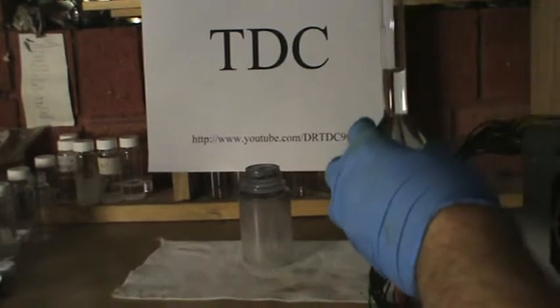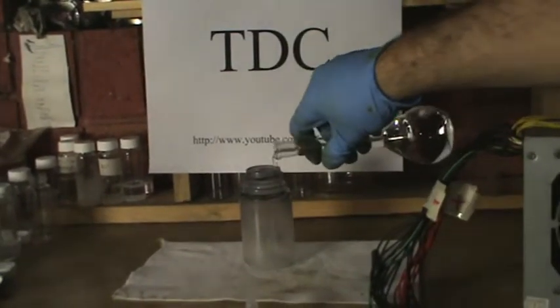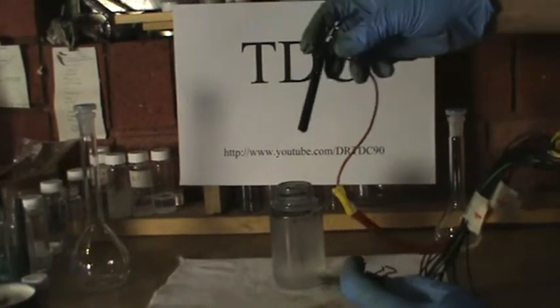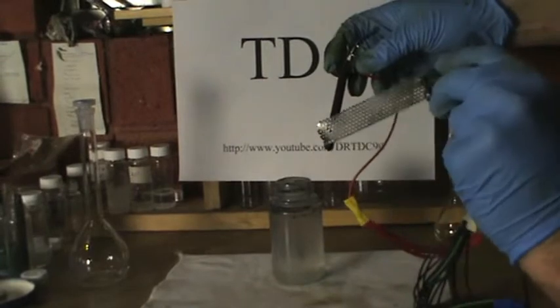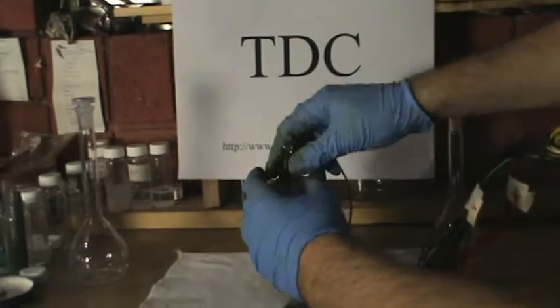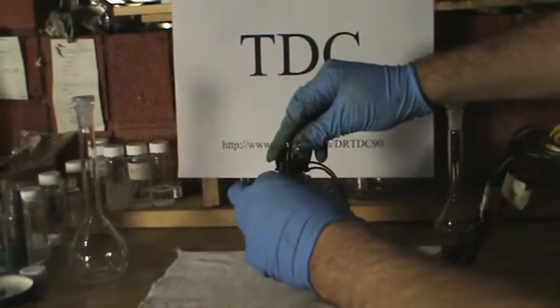Get the 10% weight per volume sodium hydroxide solution and pour contents into the container. Get the graphite electrode and attach it to the positive terminal, then get the stainless steel electrode and attach it to the negative terminal on the power supply. Immerse the electrodes in the sodium hydroxide solution and turn the power on.